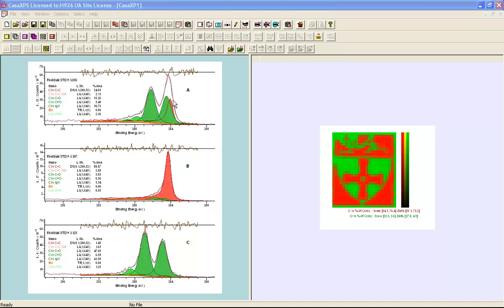This third example is an example where we have a combination of graphene oxide and reduced graphene oxide. And while we have multiple peaks involved, in essence we have two different chemical states that we would like to highlight. So in this case, the graphene oxide has been indicated as a set of components that are associated with graphene oxide by a colour. In this case it's green. In the case of the reduced graphene oxide, we can see clearly the contribution of the reduced graphene oxide to this spectrum simply by using colours.